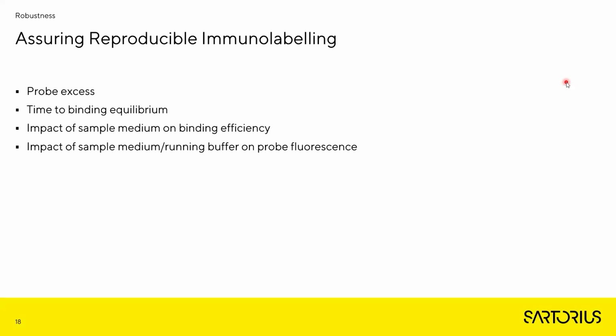A factor that is less frequently addressed is the time to binding at equilibrium, so as to actually reach the stable binding. While this might not be that important in assays such as ELISA and so on, where the readout is performed at the same time, it very strongly applies here where the different samples are analyzed sequentially.